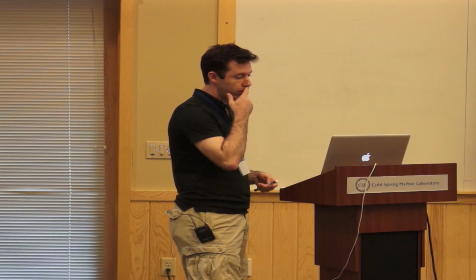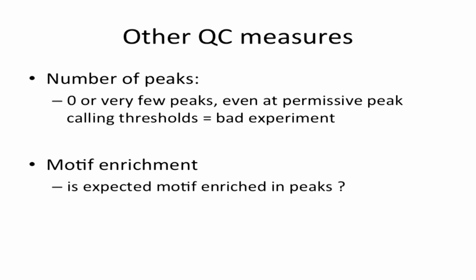Yeah, so I did want to add something about motif enrichment. When you do a ChIP-seq experiment for a transcription factor, usually by now somebody would have done a similar experiment, would have studied a transcription factor or a transcription factor of the same family, and people would have a good idea of what kind of DNA recognition site this factor or this family of factors recognizes in the genome, right?